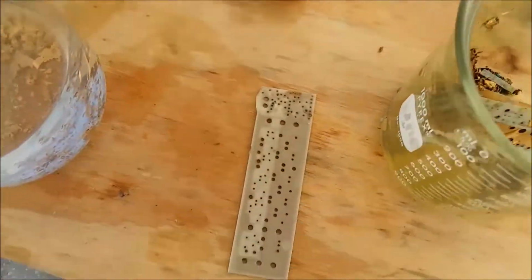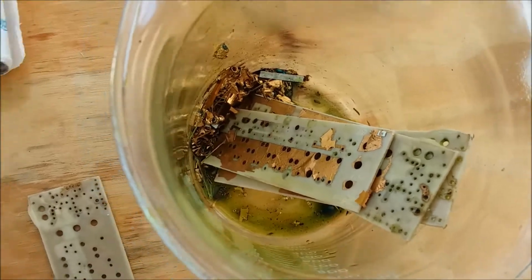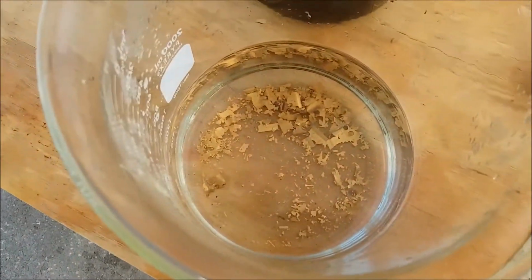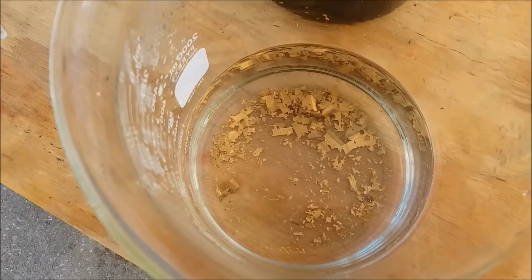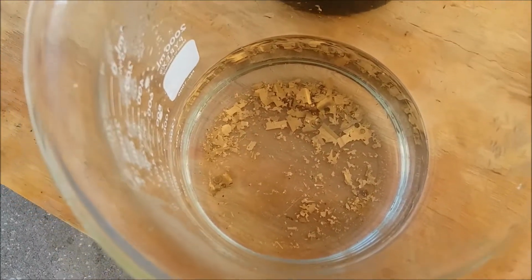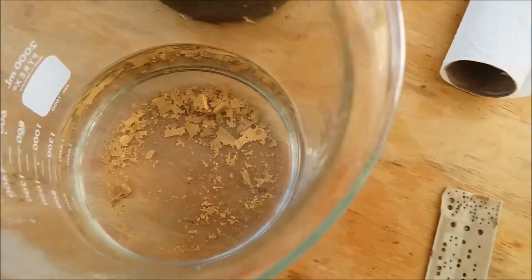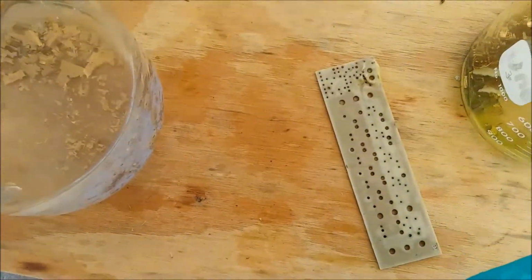And so I pulled out one piece, and it looked a lot like that piece right there. It still had a lot of gold stuck to it, but I did like I did with the fingers, and I just rubbed it with my fingers in this beaker of rinse water, and all the gold foils came right off. I may find an old toothbrush just to try and make this a little easier than trying to rub it with my fingers, especially since I'll eventually rub holes in my gloves, which is not good. But it did actually come off fairly easily, and it seems to be completely gold-free.